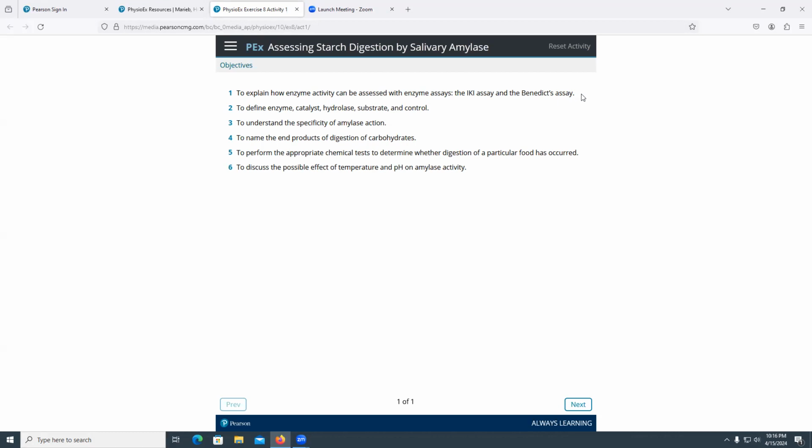So if I have 3 test tubes, one is 70 milligrams per deciliter, the other one is 90 milligrams per deciliter, and the third one is 100 milligrams per deciliter, and I apply the Benedict assay, the one that was 70 milligrams per deciliter will turn green. And the second degree, let's say 80 milligrams per deciliter, more than the 70, will turn, for example, orange. And then the last one, if it's 100 and above, now it's going to turn red.